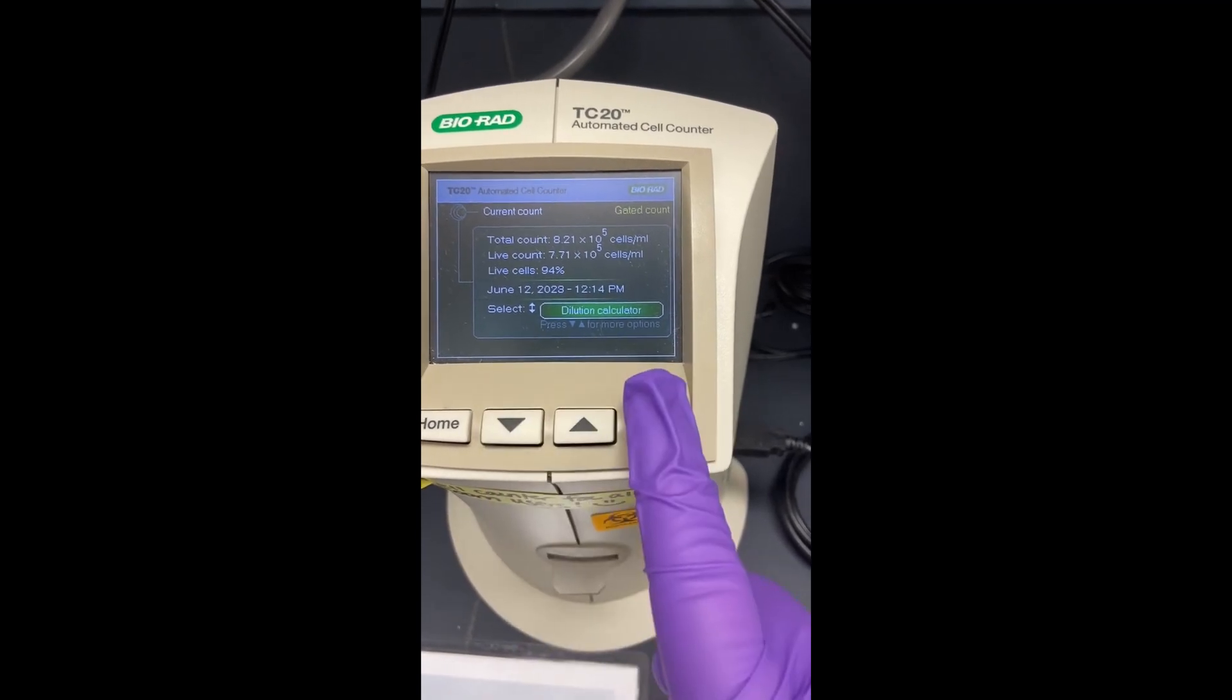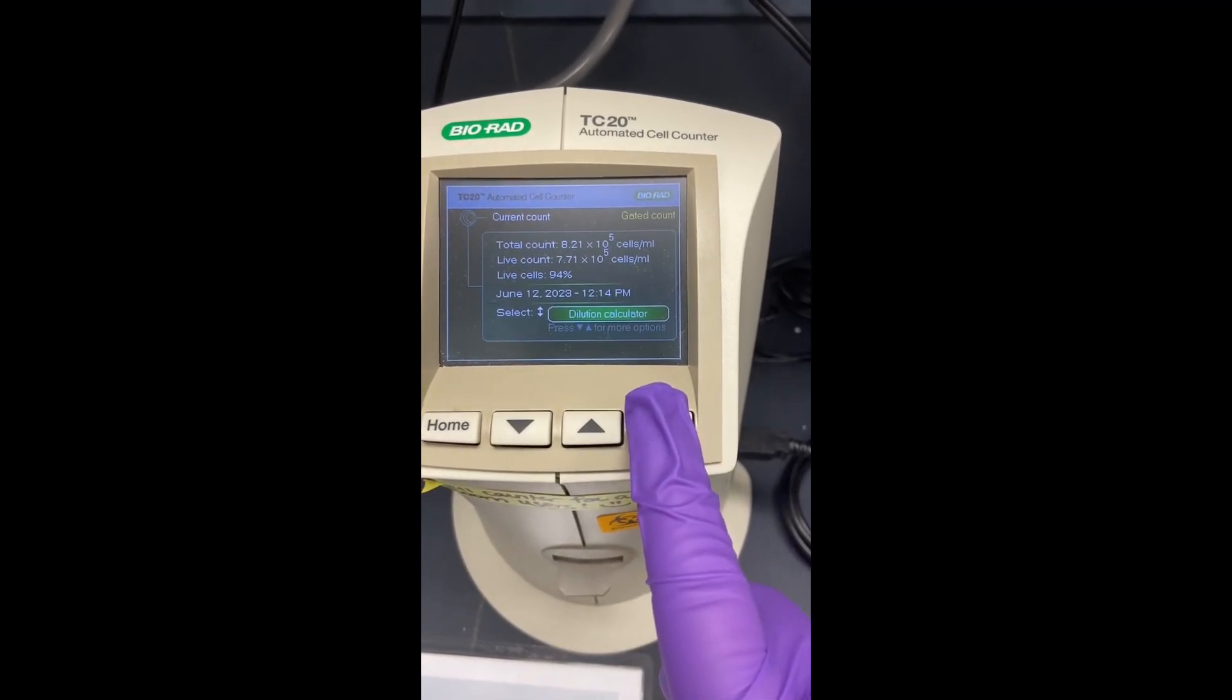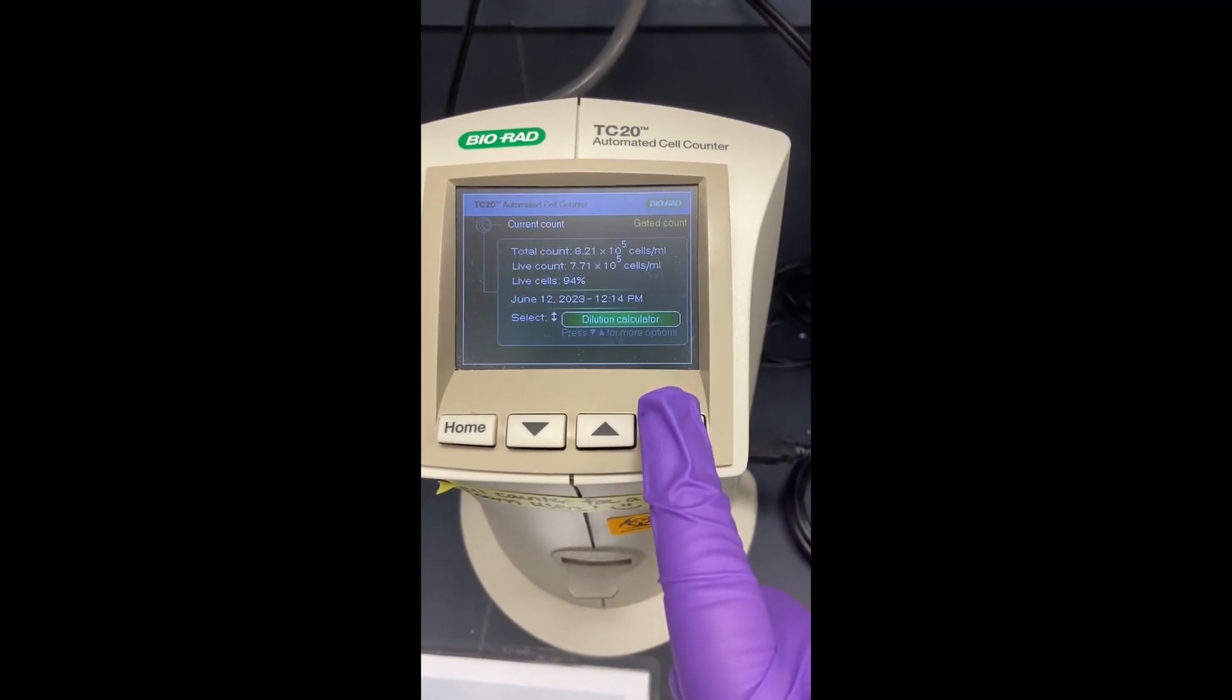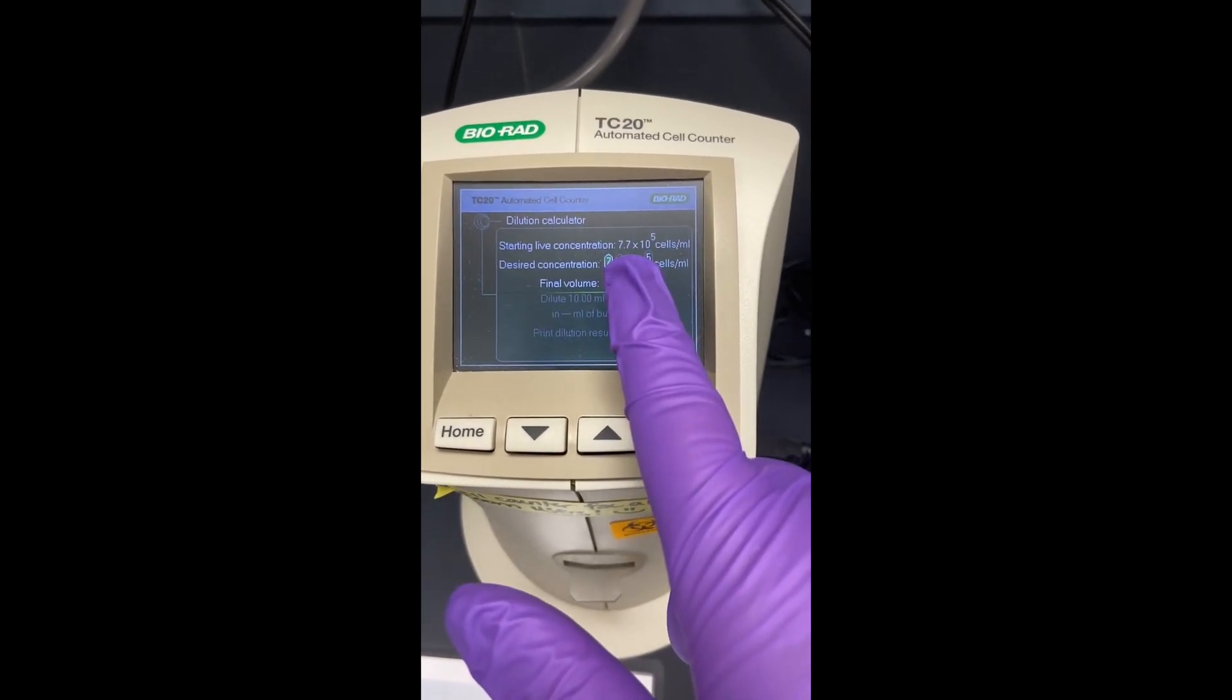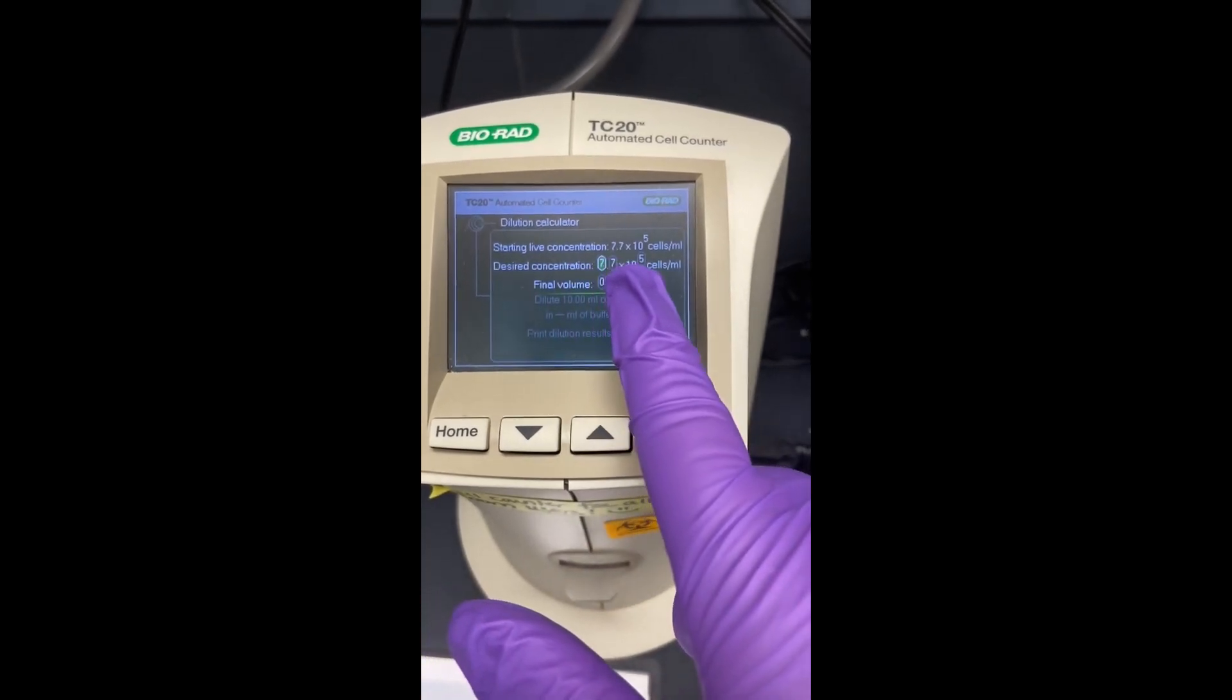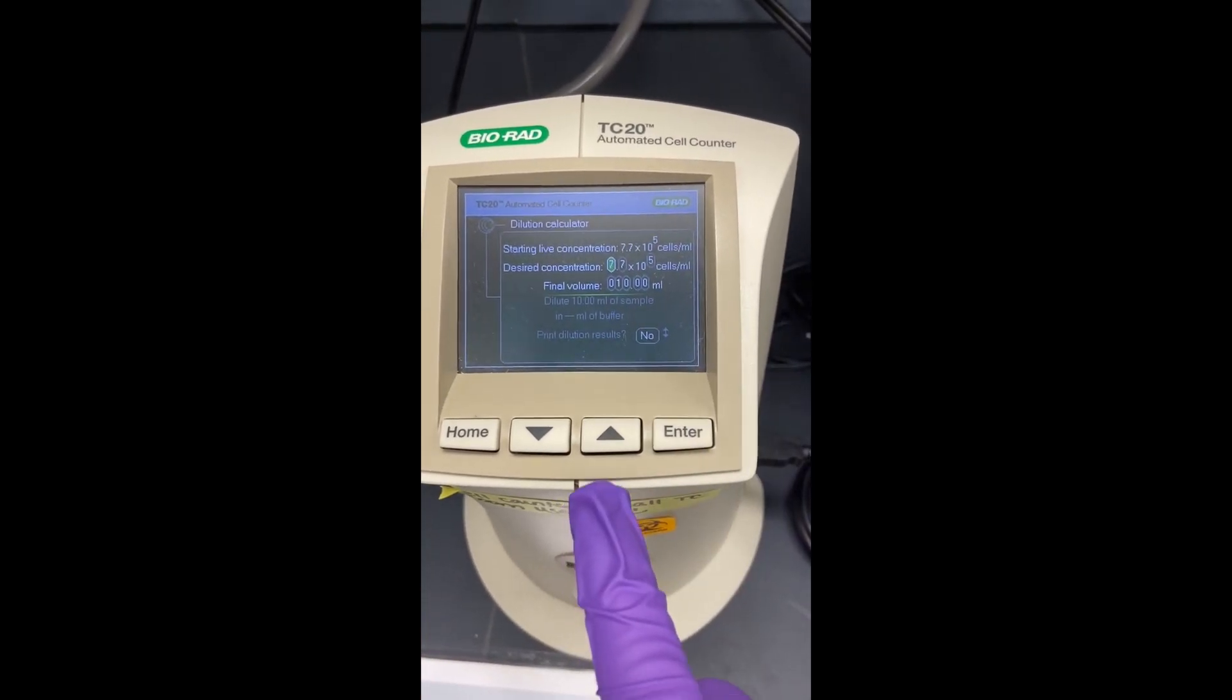But what's most useful, quite honestly, if you're happy with your percentage of live cells, which I am, is your dilution calculator. And so it automatically uses your starting live concentration because usually you want to plate live cells.